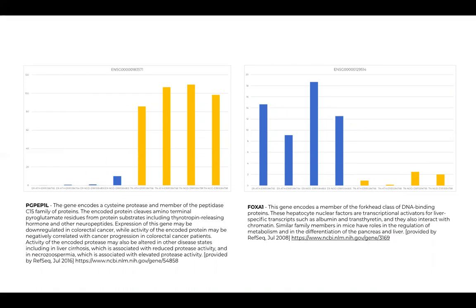So this is the factor regression analysis. It is eliminating the mouse factor and giving you information about just one factor, which is the cancer. That is the information you got using this factor regression analysis.